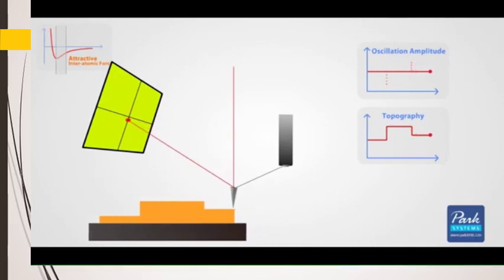Non-contact AFM has many advantages over contact AFM. It preserves your sample surface because the tip and surface are not touching. By prolonging the sharpness and lifetime of the tip, it allows for high-quality imaging over many scans. This also brings down the total operating cost of the instrument, as tips are expensive to replace.